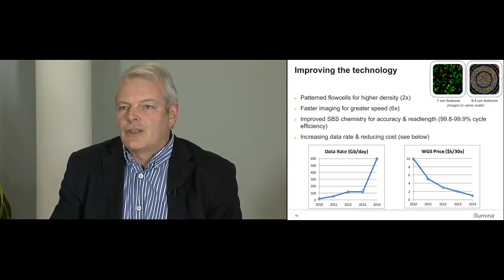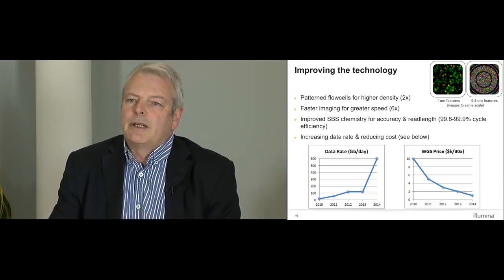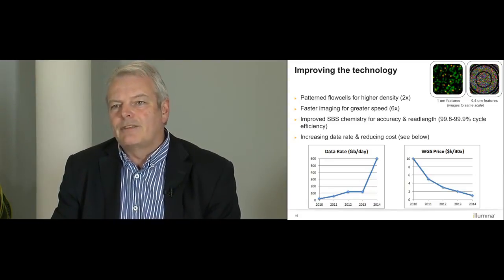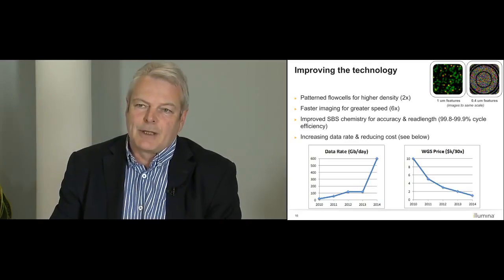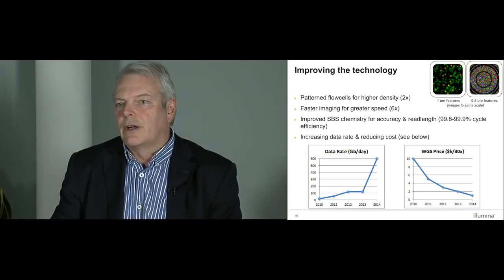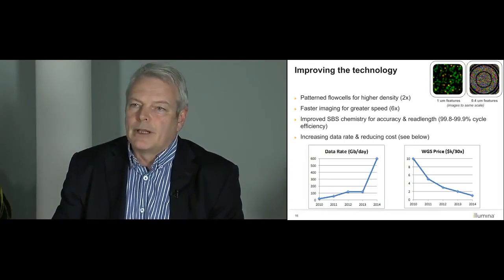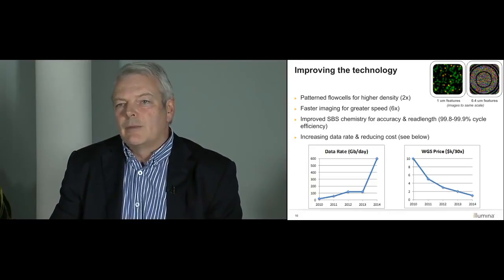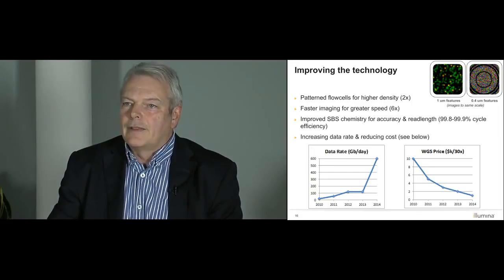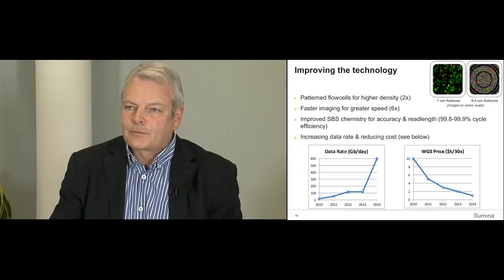This was not just a major technology improvement, and this was the launch of the HiSeq X, but it was also a development program that was stimulated because of the perceived need in the community and the appetite for moving to larger amounts of sequence and taking whole genome sequencing on up to whole genome levels and to population scale. One of the major impacts, of course, is that as a result of the increased data rate, the actual cost of the experiment goes down significantly.